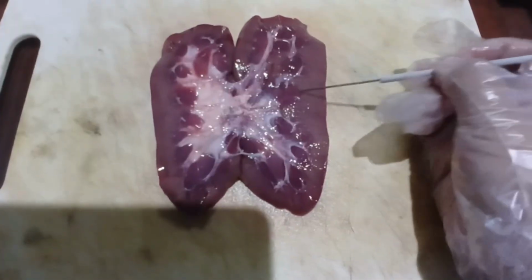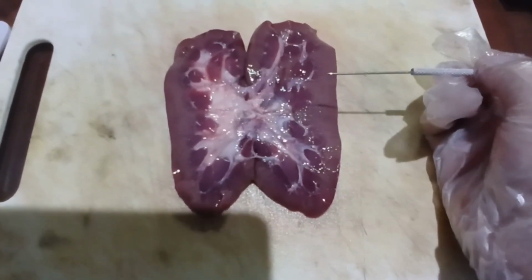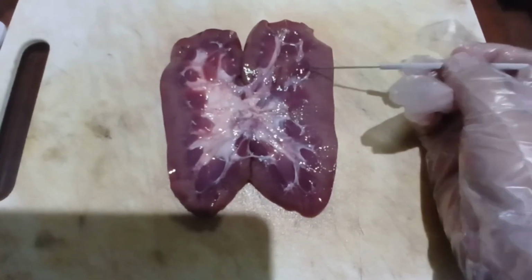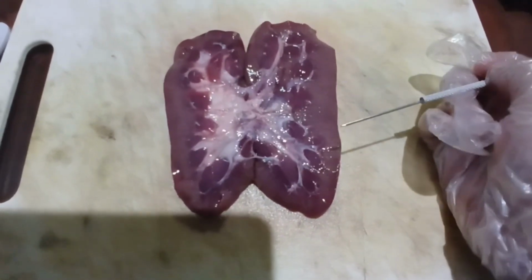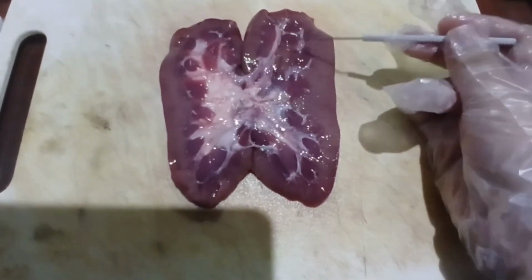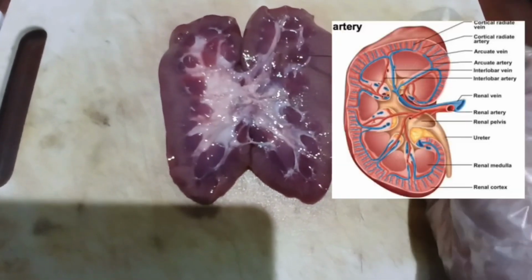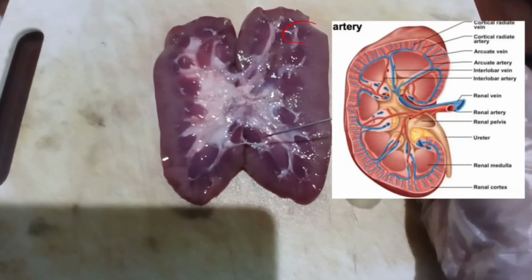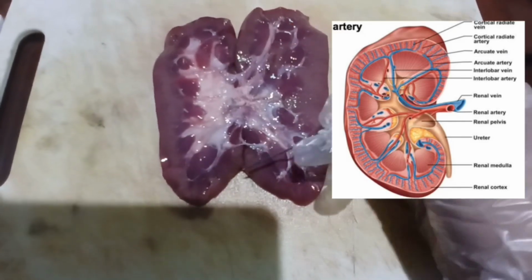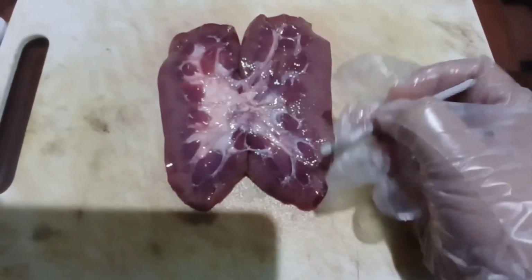That's the definition. Again, these peritubular capillaries are the ones essential for the reabsorption of nutrients and the water back to our blood. And of course, this is the secretion of waste products. The cortical radiate vein functions by collecting blood from the peritubular capillaries. Basically it goes to the arcuate vein.